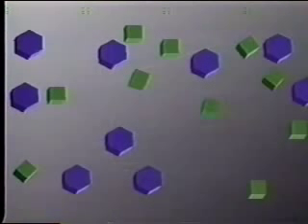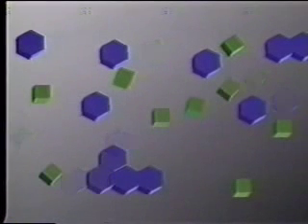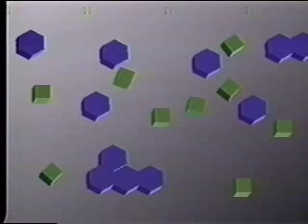Crystallization must be allowed to proceed slowly. In a proper crystallization, an equilibrium is established between molecules in solution and molecules in the crystal lattice. A molecule will tend to become attached to a growing crystal if the crystal is composed of the same type of molecules because of a better physical fit.